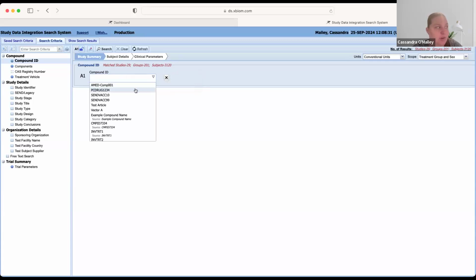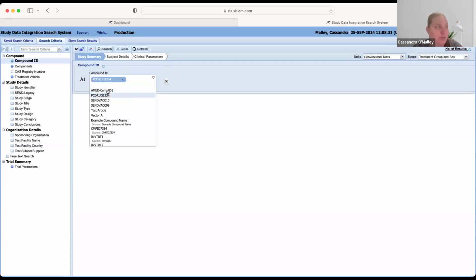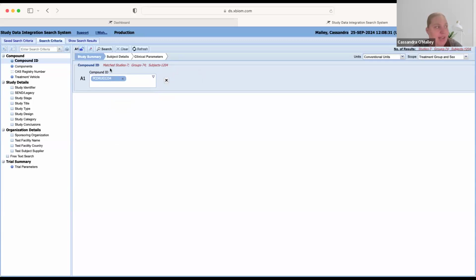And now that they've loaded, I'm going to click PC drug 1234. And I see as I've clicked that, I go from the 29 studies that were there previously, and it's dropped down to just 7 match studies.